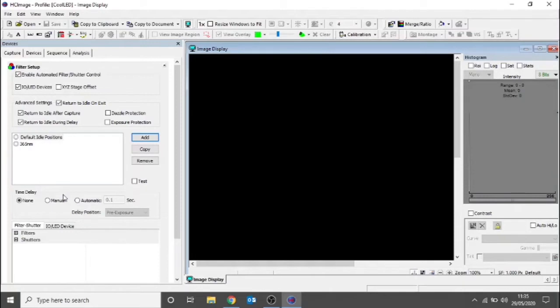In the pE-4000, there are 16 available wavelengths, from 365 nanometers to 770 nanometers. These 16 wavelengths come in 4 channels, meaning up to 4 LEDs can be switched on at once. The choice of wavelength and intensity required can be chosen and selected below, under the I/O LED device tab.